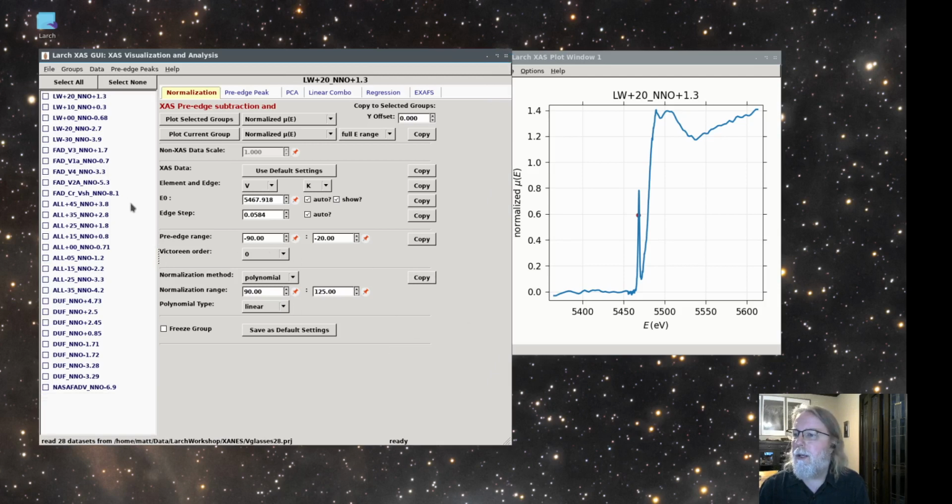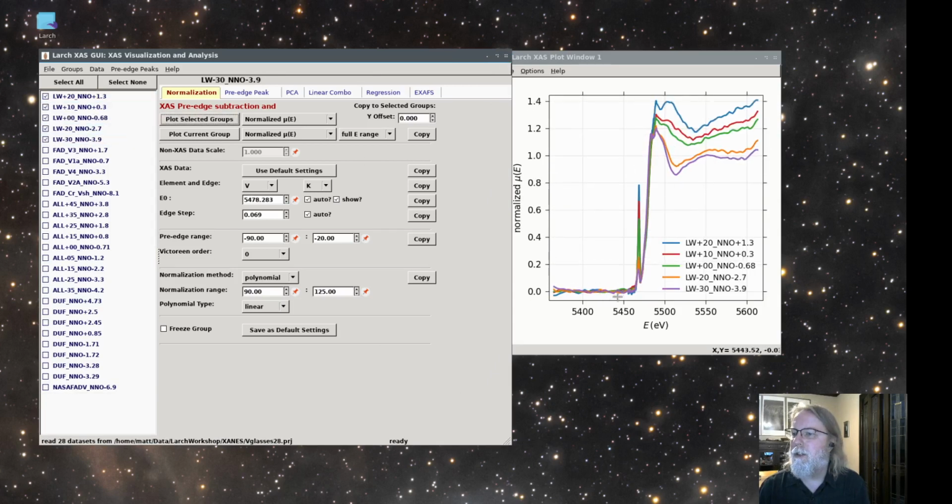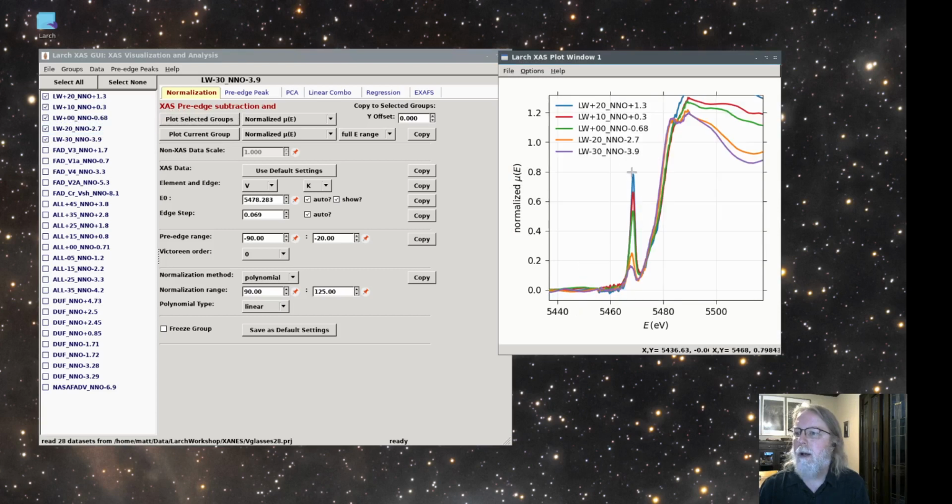This shows a common set of results for vanadium K-edge XANES: there's this very large pre-edge peak for highly oxidized states, vanadium 5+, like chromium 6 or manganese 7 has a very large pre-edge peak, and as you change the oxidation state from 5 to 4 to 3 to 2, this peak decreases in intensity. And in fact, many people have used a fairly straightforward measure of the relative intensity of that peak as a way of getting oxidation state from XANES spectra.